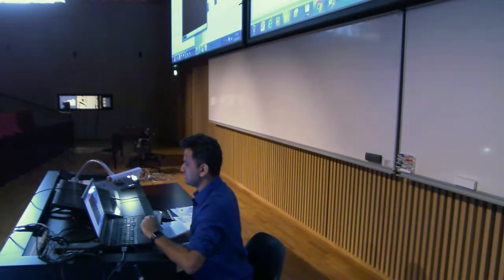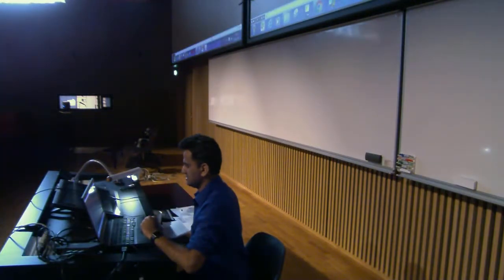You can actually make an animation. Just let's make a small animation. Let's say just add here, landmark view, and start freehand recording. Click here, and then just change it to zoom a little bit. I would make it like zoom.